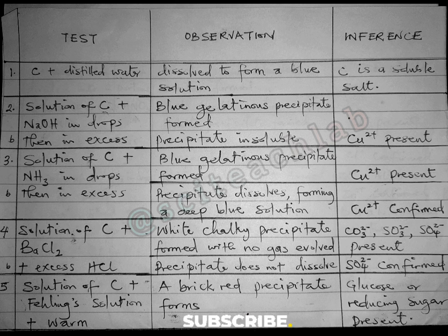So we go ahead. If maybe in your own question paper, you are given to find also the sulfate ions, then you have to go ahead. Remember, you may not be given everything here. You may be given just 2 of them, or 1 of them, or all of them. So I'm giving you everything that's possible that you would see there.